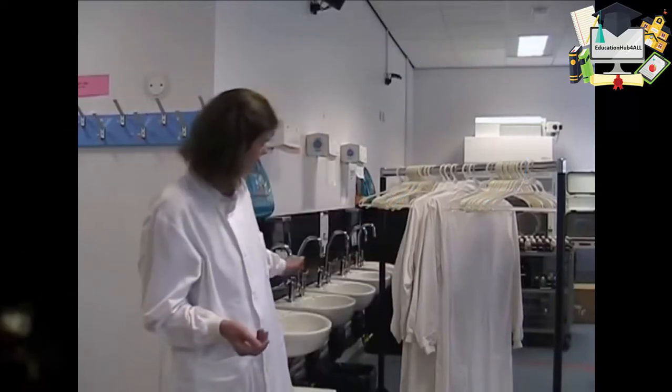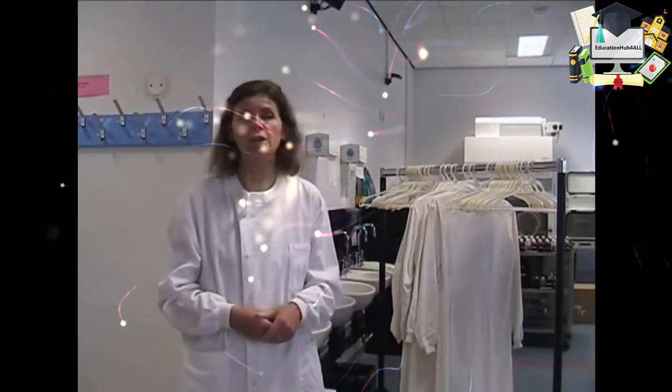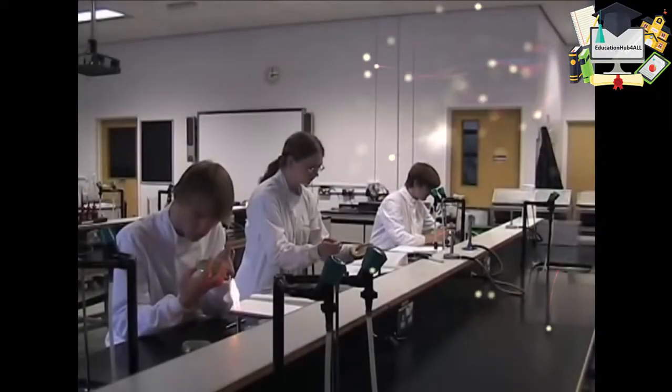There should, of course, be no contamination on your hands. If you should at any point spill anything on your hands, you would then come to the basin, wash your hands, disinfecting them before you continue working again. If you're thirsty during the practical, what you do is you come here, you take off your lab coat, you disinfect your hands, you go out and take a drink of water outside the lab and then come back in again. If you happen to have any cuts on your hand, these are a portal of access for microbes. Therefore, any small cut should be covered with an elastic, a plaster. If you have long hair, you must have it tied back behind your back.